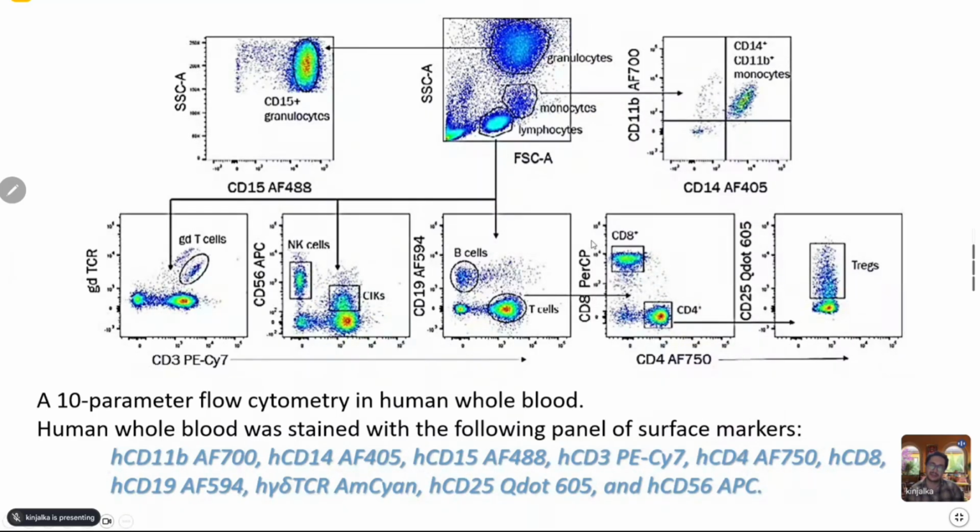So you have your CD8 and you have CD4. These letters that you see are basically codes for different colors, and I'll show you a list. There are different shades of red, green, yellow, blue, a mix of all that. Based on this fluorescence, they have been able to identify from this whole pool that these are the CD8 cells.